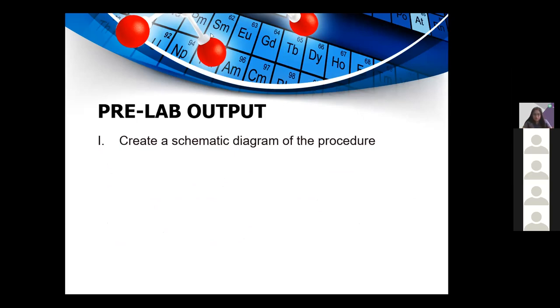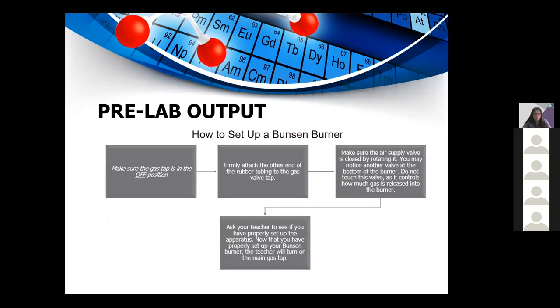This is the schematic diagram of the setup procedure. Make sure the gas tap is in the off position, then firmly attach the rubber tubing to the gas valve. Make sure the air supply valve is closed by rotating it. Do not touch the valve at the bottom of the burner as it controls how much gas is released. Ask your teacher to verify the apparatus setup. Now that you have set up your Bunsen burner, the teacher will turn on the main gas tap.